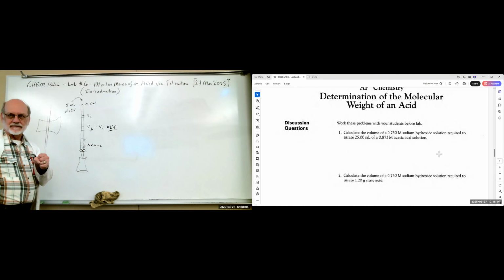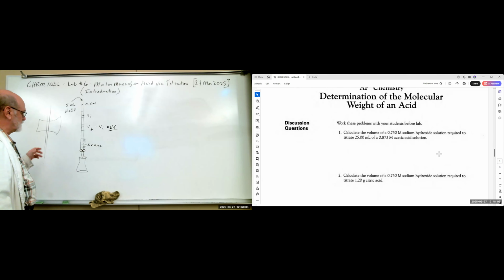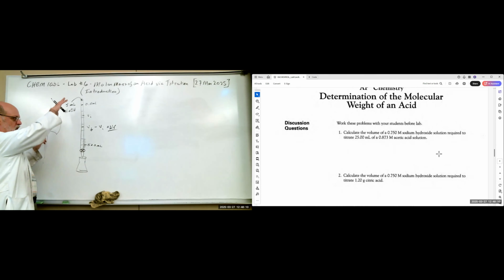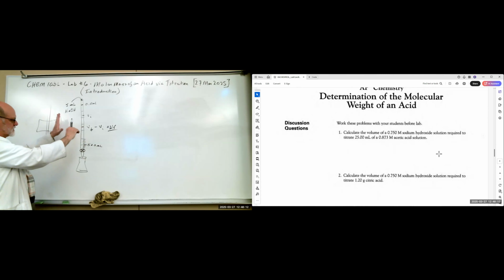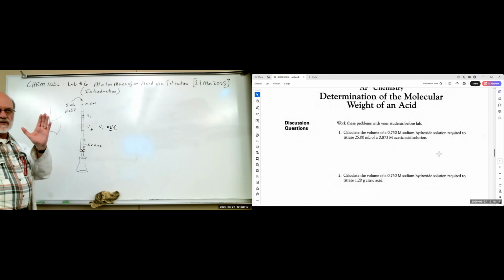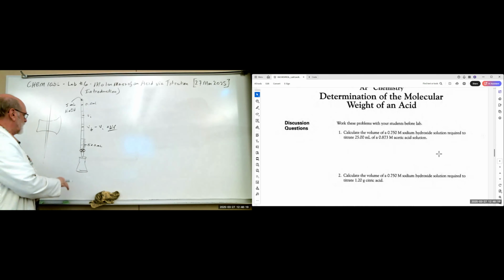We're not going to do that kind. Actually, that's a little more involved than we need. We're just going to use one side, and it's got a clamp. You just open the clamp by squeezing it, slide it in there, and let it loose, and be sure it fits in its grooves. There's grooves in there. That's what holds it.